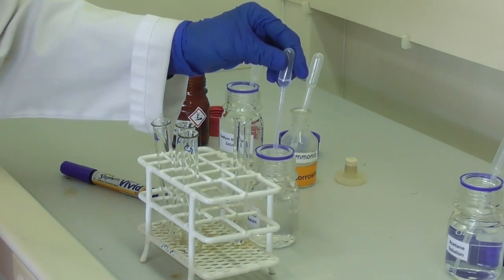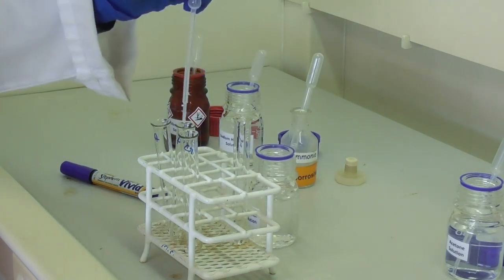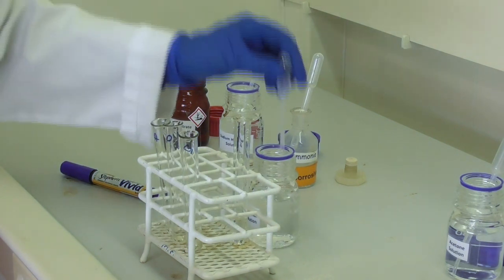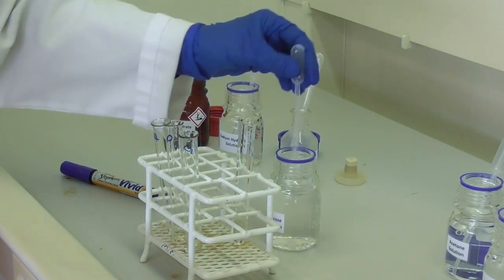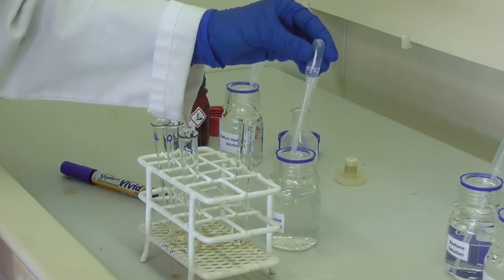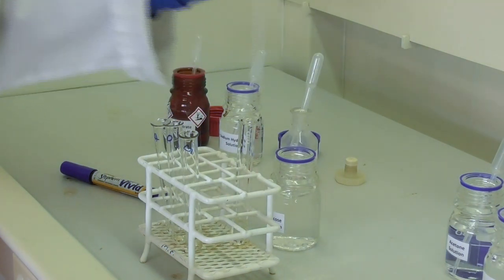To the second test tube, we add one milliliter of propanal. To the third test tube, we add one milliliter of glucose.